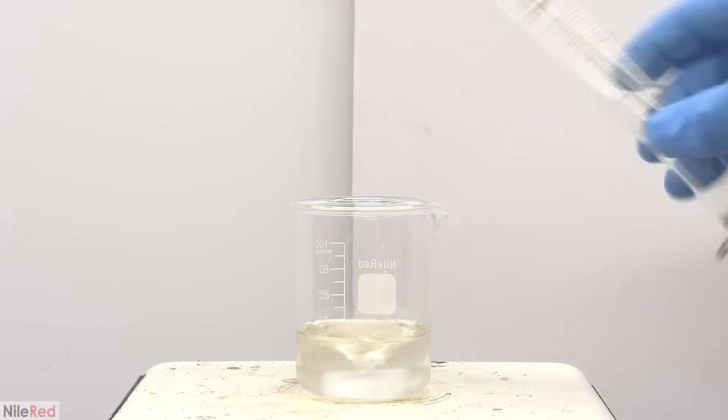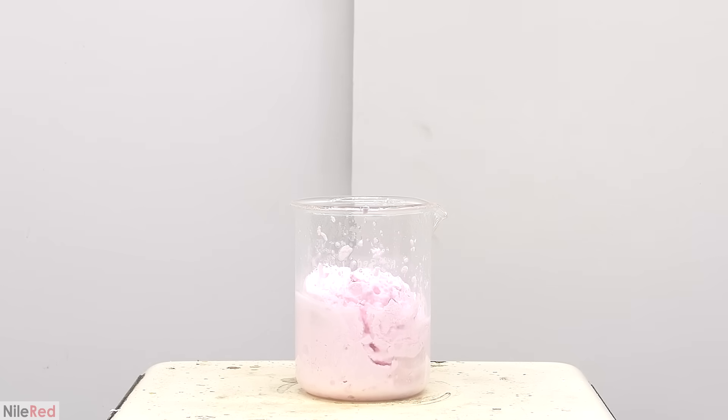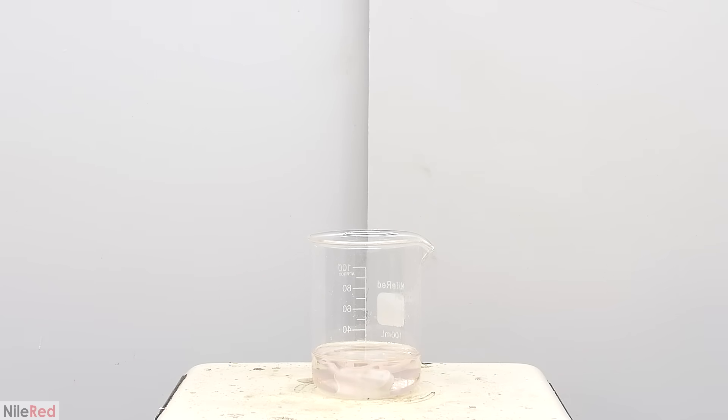Just for fun, I wanted to see what would happen if I added all of the acid and then quickly turned off the stirring. Without the stirring, the reaction seemed to be a little bit more violent. I tried it again, hoping that it would be violent enough to pop out of the beaker, but unfortunately it wasn't.